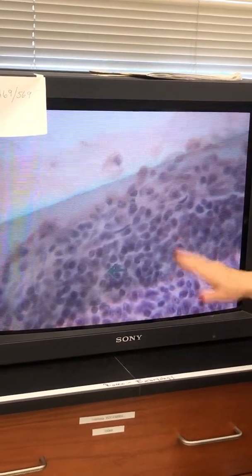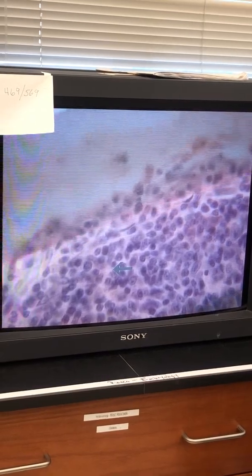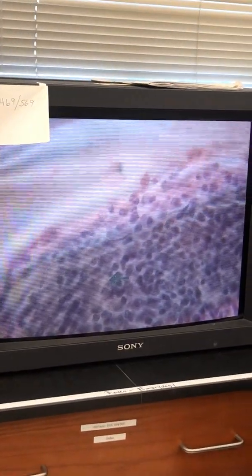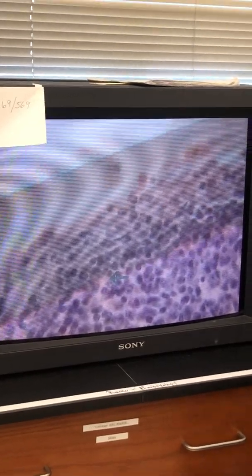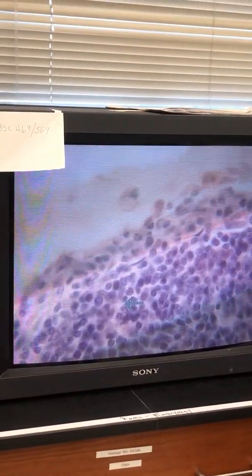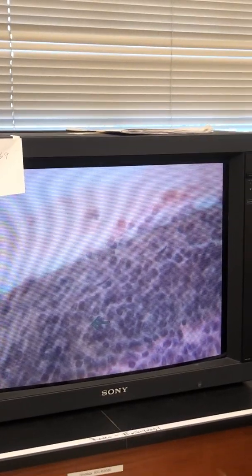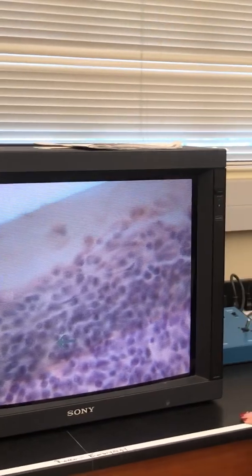Now if we could look at some different areas, but this was a really good area where I could see two. That's really good, it's dark, and you can see that it's narrow, it's a thin cell that's elongated. Is everybody good with that? So we've seen everything except a reticular cell, so that's the littoral cell, you've seen that.